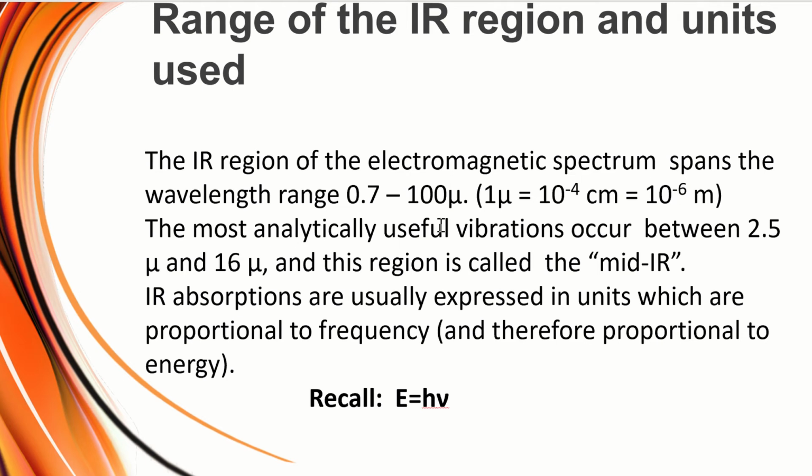The most analytically useful vibrations, however, occur between 2.5 microns and 16 microns. And so this region is actually called the mid-IR region, where IR absorptions are usually expressed in units which are proportional to frequency and therefore proportional to energy, because we recall this equation here where our frequency is directly proportional to energy.